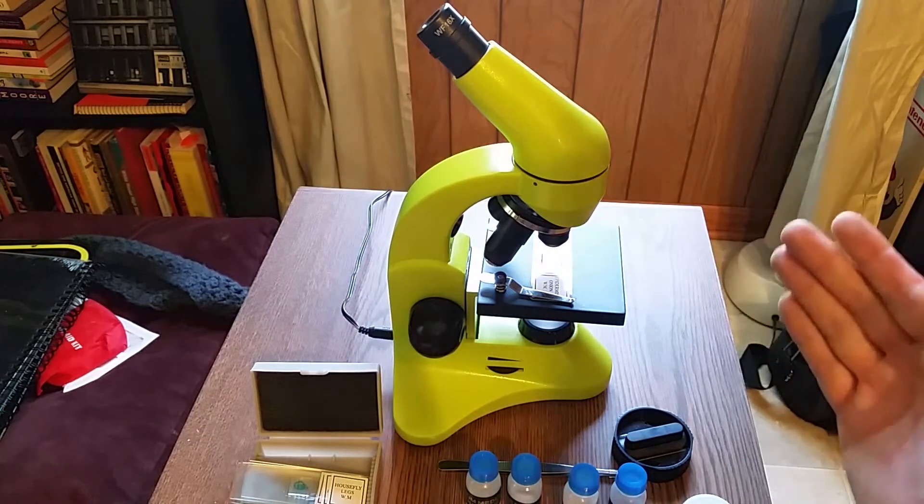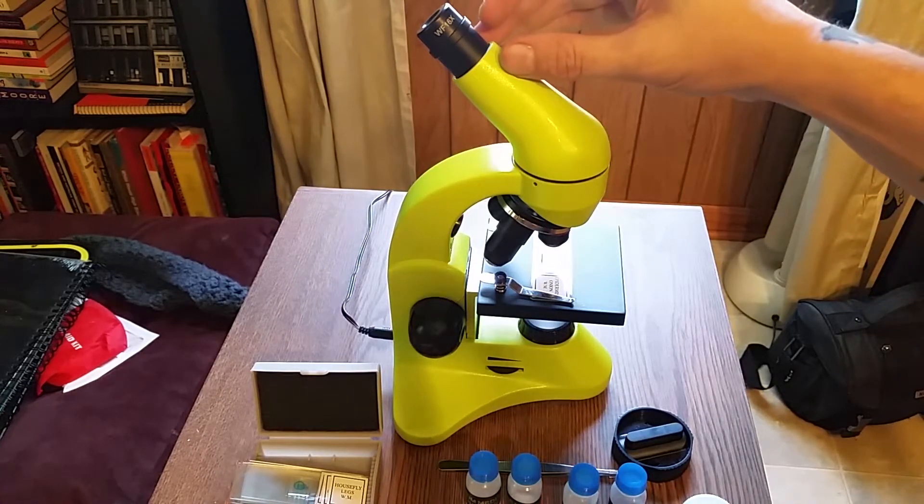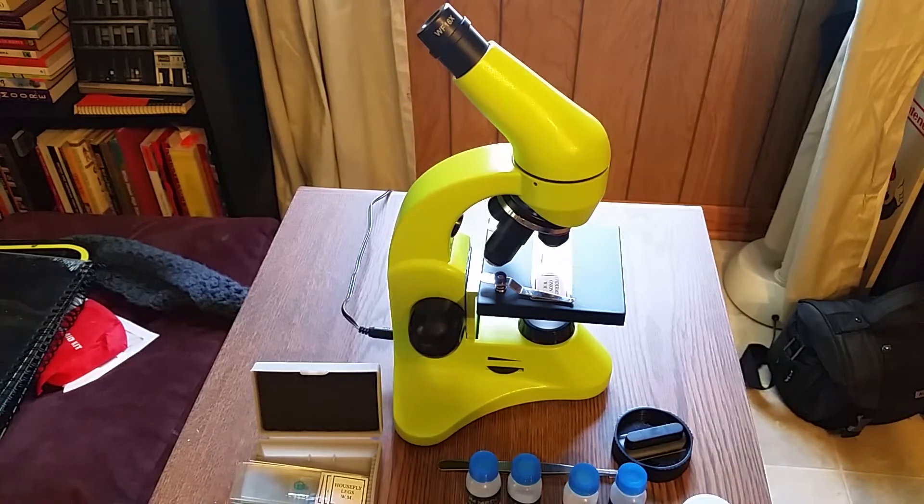There are three different microscopes presented in this series: the 50L, the 50L Plus model, and the D-50L Plus model. They all have really good things going for them, but if I had my say, I would go for the D-50L Plus model. The reason is that it comes with a 2M digital camera as well as software, which means you can set it up to stream things into your computer, look at what you're doing, and go back to review what you've done afterwards. I think that would be a lot of fun for someone getting back into it.